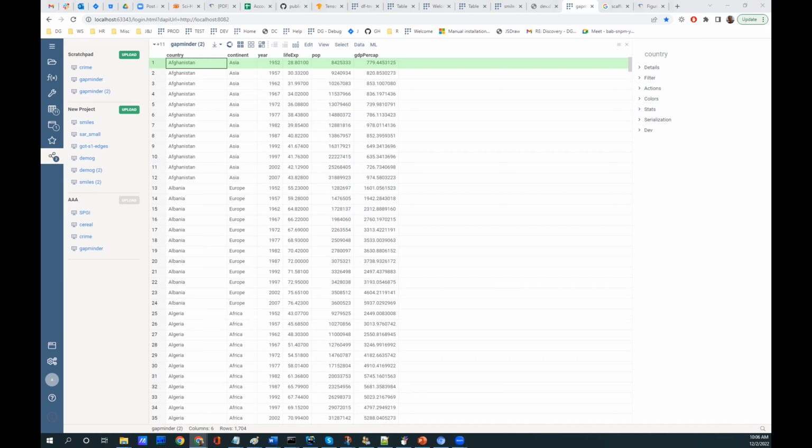Because I do not use Dendrogram that often, maybe I'm just not used to this. I feel a little bit uncomfortable all the time because I can never be sure that I've saved all my changes, and what exactly gets saved.